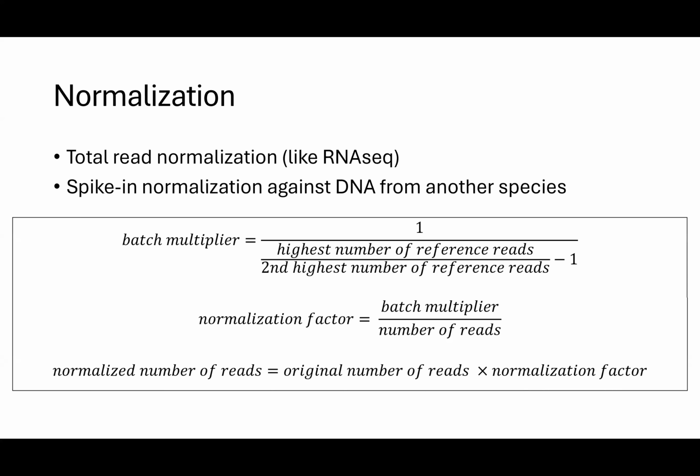Because in the preparation of the enzyme, there is some left over, since it is produced in bacteria, there's enough residual. And because you add the same amount of enzyme to each sample, you kind of are doing the spike-in, even if you didn't mean to. So I think that's a cool thing I haven't played around with, but if you get enough reads of it, it could also be an option.